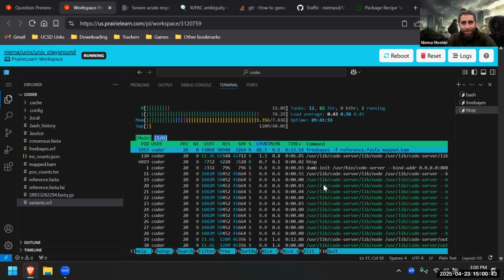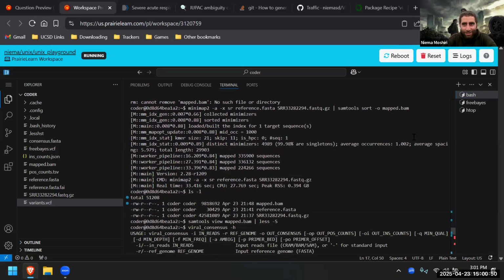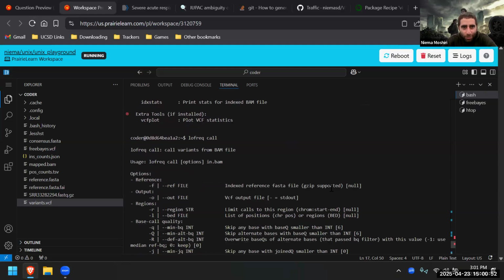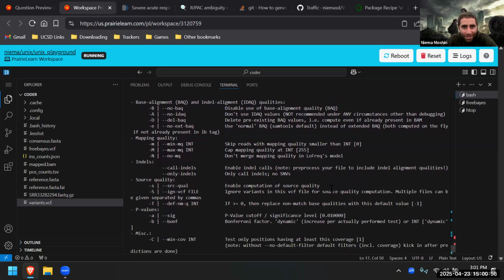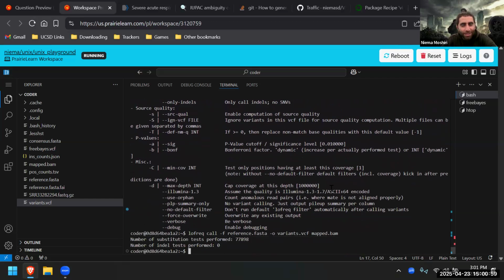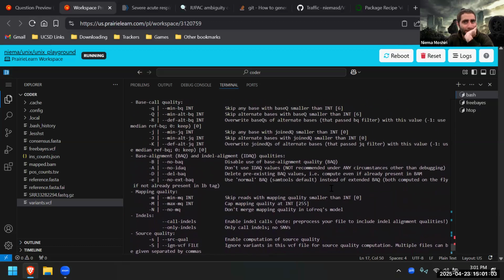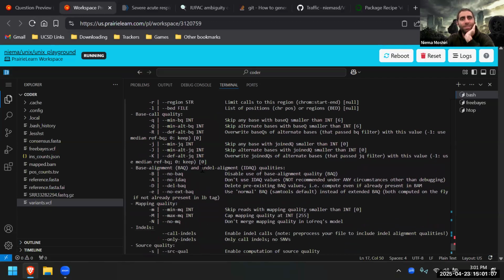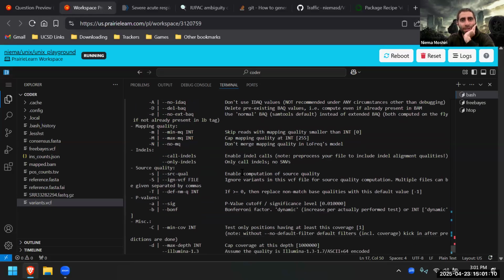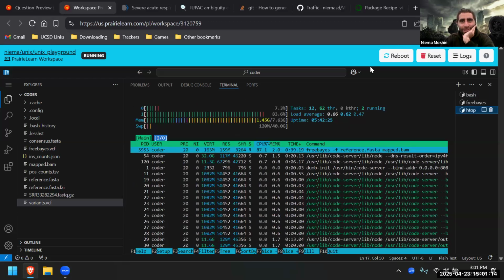Yeah, it's still running. While that's running, I can see why. Why did this not output the base calls? Because it outputted some of the rows, but I'm not too sure. Maybe some of the settings are too high for this data set, so maybe this is not a super good quality data set. I don't know.